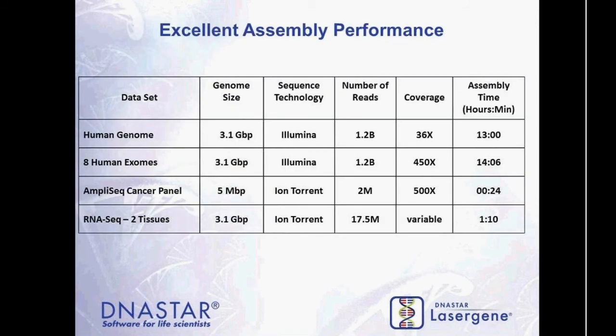So one of the most common questions we get from customers performing next-gen projects regards the power and the performance of the software. Now, there are many different assembly options out there, but more often than not, they do need high-power computer hardware setups or Linux cluster options to be able to run properly. Now, our software is designed to run on a more modest desktop computer setup without sacrificing any of these performance variables.